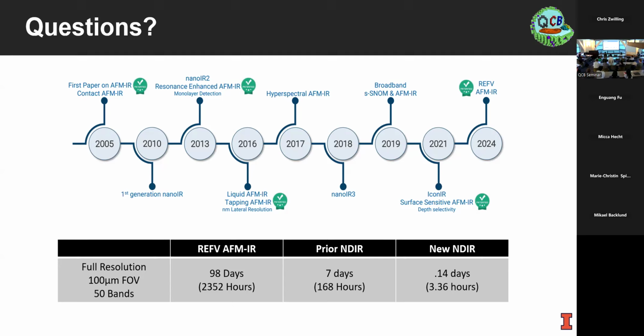Could you talk 10 seconds about tomography prospects and how the SNR is the critical stumbling block? Well, obviously, with that serial section method, SNR is not a critical one, but you have to be able to find them and then overlap them. The other one is FIB etching, milling. Then you need a combo FIB and AFM, which you really want. I don't know if I want to build that yet.